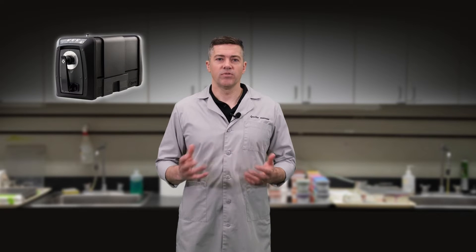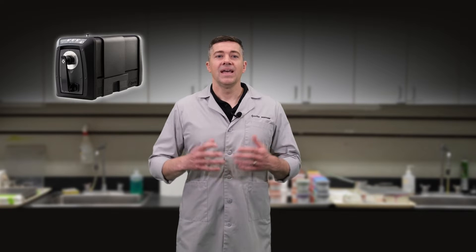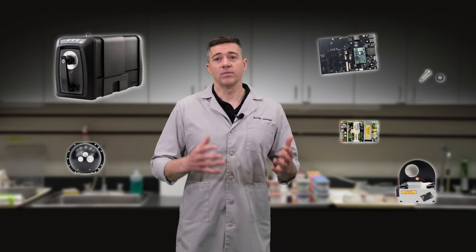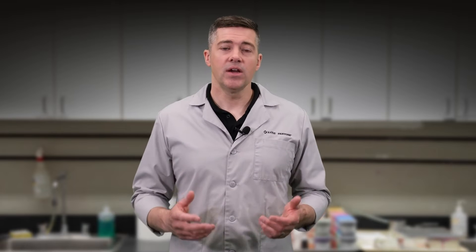When your instrument is first assembled, a factory initialization is performed. This is the foundation of your instrument's performance. Each initialization process is tailored to that specific instrument. Every component of the instrument is characterized, from sensors and optics to the fully assembled product. To teach the components and assembled unit what color is, your instrument is characterized with several parameters including white, black, color calibration, UV, repeatability, and drift to ensure alignment with our Centroid — all traceable back to NIST.